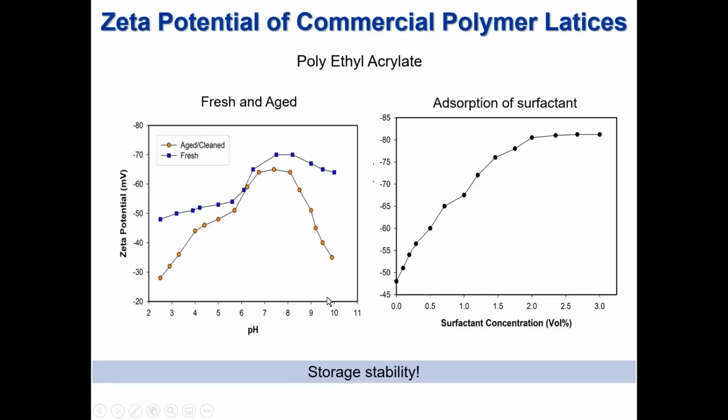Polymer latexes are used in a wide variety of applications, and a common method of industrial production is by emulsion polymerization. The final latex particles are stabilized by sulfates and carboxylic groups, which are chemically part of the polymer surface, resulting from the initiator used in the reaction. In addition, there will be physically adsorbed surfactant molecules from the emulsifier, which have polar groups, anionic or non-ionic.